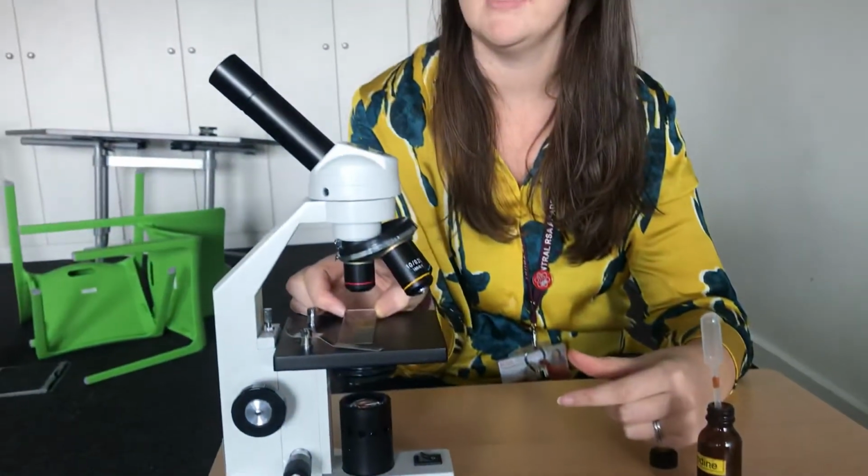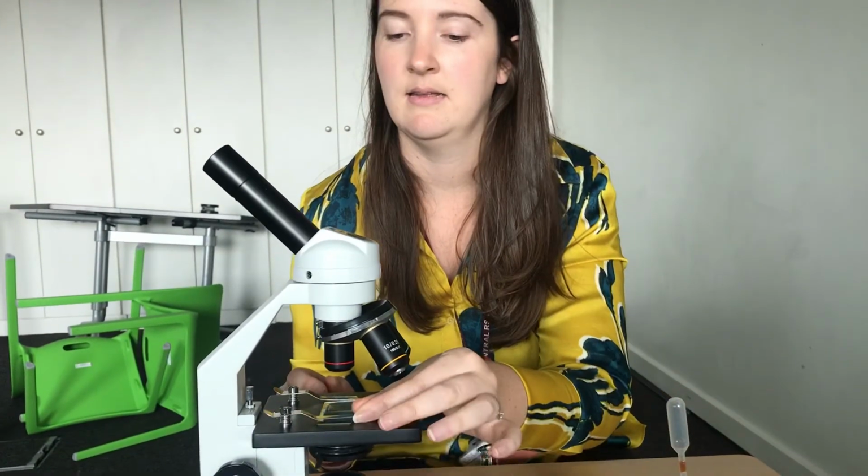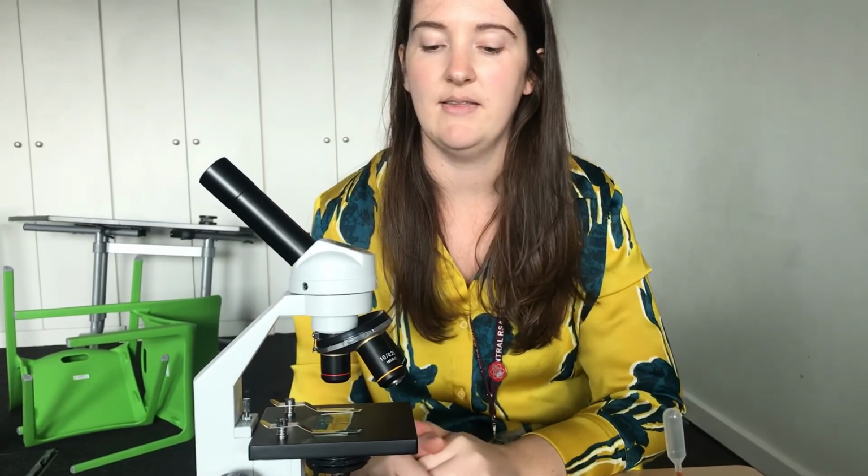So I put it on top of the stage and clip it in. Set my lens to the lowest power lens to start with, and then that's ready to view.